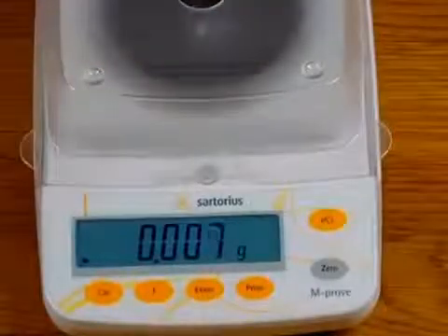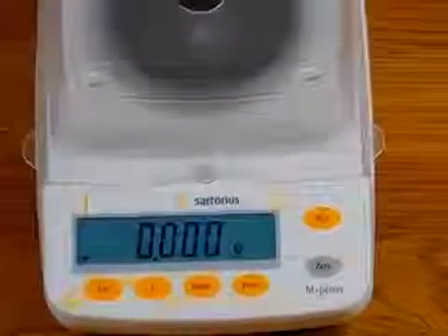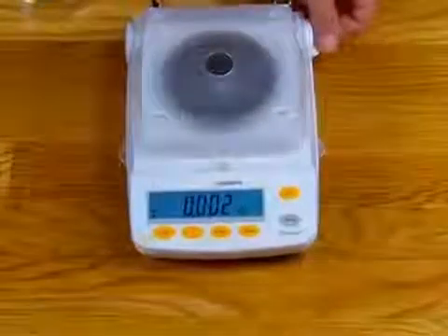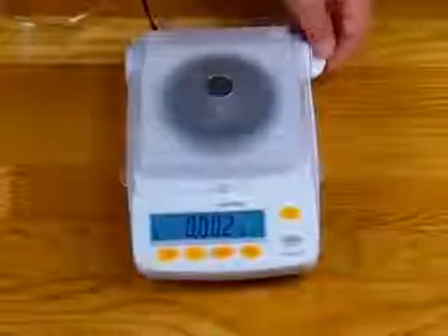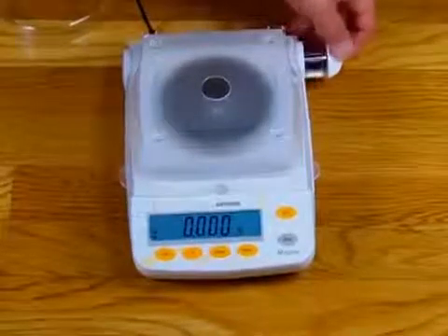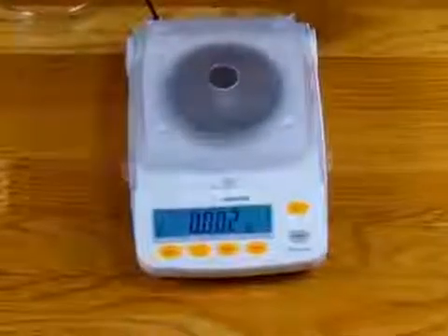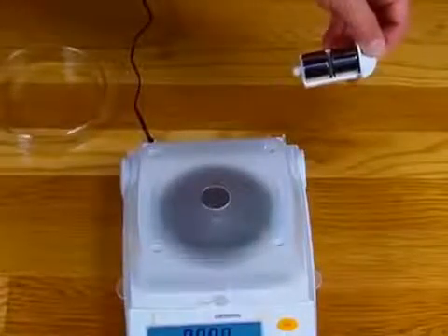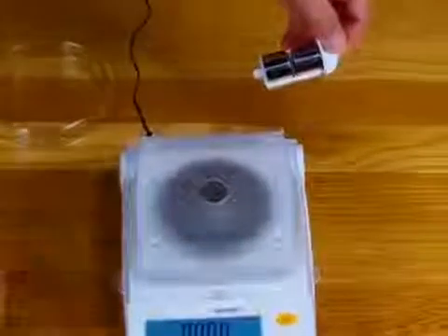A lot of people call us on the AY series asking, where are the calibration weights? Certain models come with the calibration weights, basically up to the AY612 comes with a calibration weight. So the cal weights are located right on the side in this little tiny tray here. If you buy the AY123, that would come with 1. These are 100 gram weights, so it would come with 1. On the AY303, you get 2 100 gram weights.